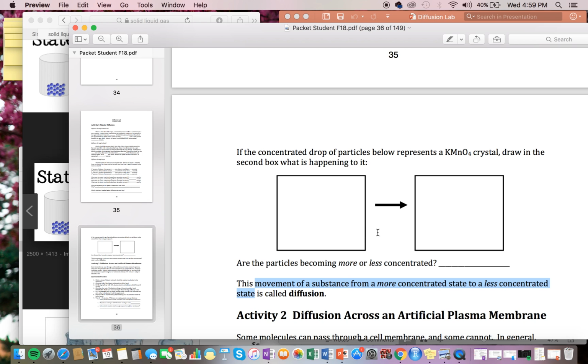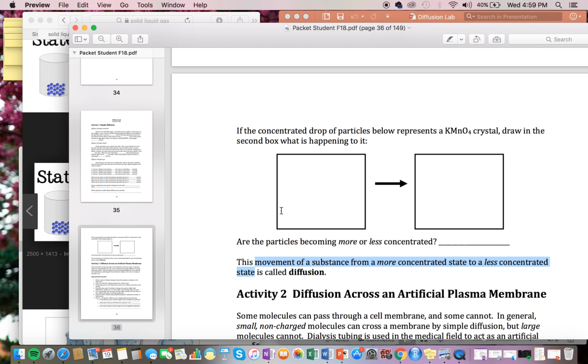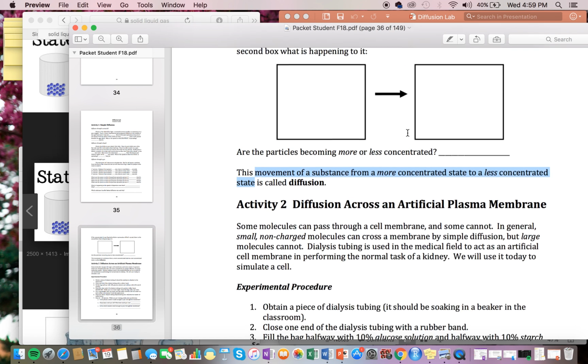So if I were to spray the molecules out, we'll have a pretty fast diffusion rate because that initial energy of me spraying is going to shoot them out, right? But if I'm just setting them on there, it's going to be kind of slow, and you saw that in your petri dishes. So it was slower. But yeah, it has to do with just random molecular motion, things moving around. And all molecules do that if they have energy.